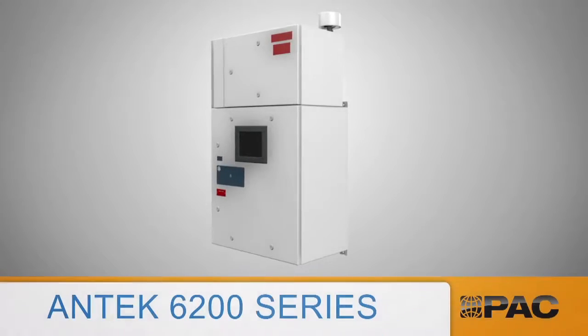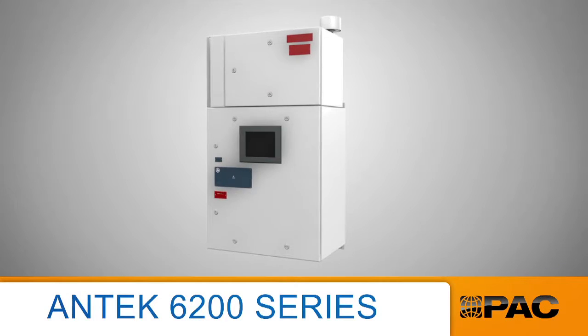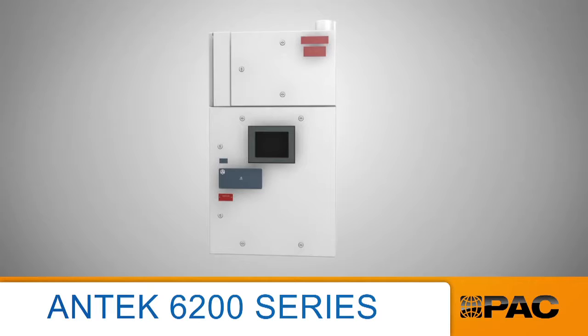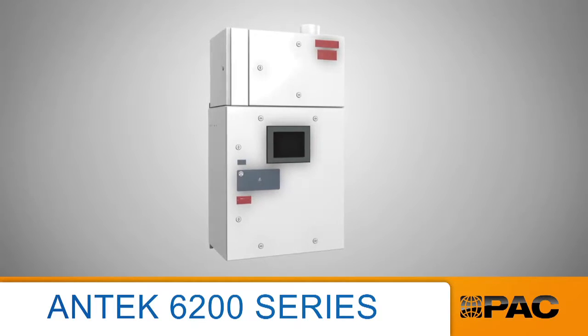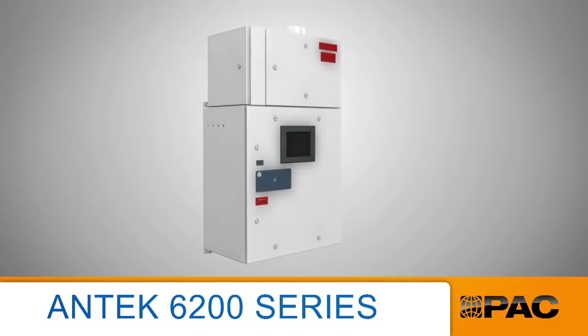The Antec 6200 series is a process sulfur and nitrogen analyzer with a unique technology that ensures you will meet the specifications for your products.